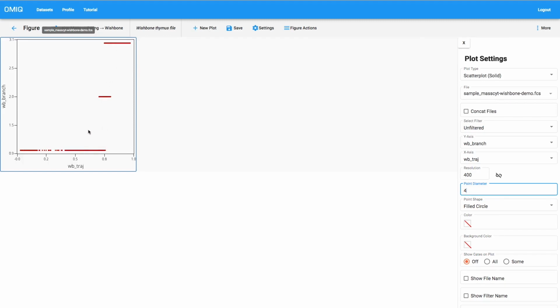A good thing to check out here is that this association actually makes sense in terms of our expectations. So we're always looking for a main trunk, and then we're looking for a branch point, and then we want to see the cells have kind of cleanly gone into these branches. Sometimes if Wishbone hasn't worked quite correctly, and it's not always clear why, given the complexity, you might see a pattern that doesn't look like this. So you might see the branches appear and the trunk come back into place. And we generally consider that to be kind of a shrug, and say, not clear why Wishbone isn't working quite correctly. So keep that in mind. Feel free to engage with us if you see that.